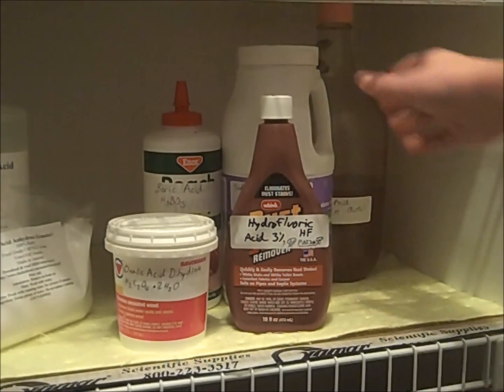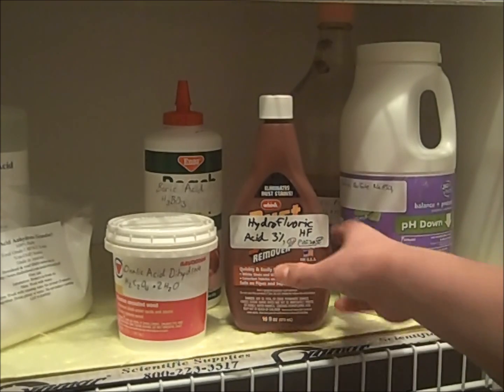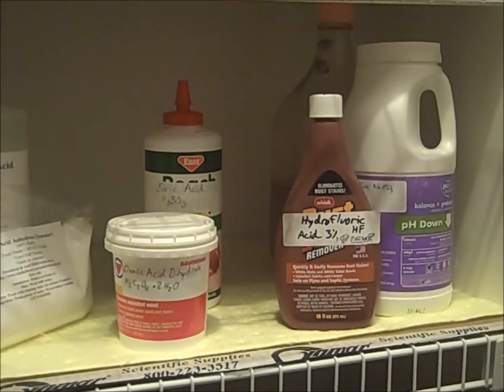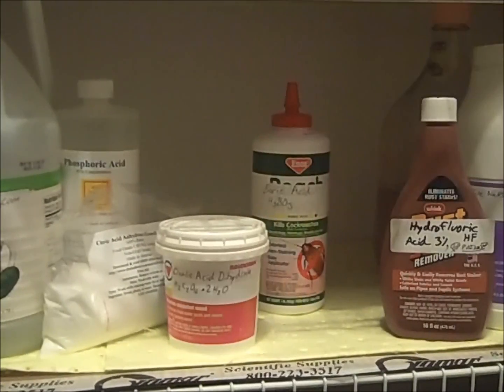Next to it is the similar chemical, sodium bisulfate, which is sold in many places such as Walmart as a pH lowering chemical. It is a safe alternative to muriatic acid because it does not give off fumes which are a respiratory hazard. In this brown bottle is a 3% solution of hydrofluoric acid sold under such brand names as Wink Rust Stain Remover. Next to it is oxalic acid dihydrate, which is sold by Ace Hardware as a wood bleacher.